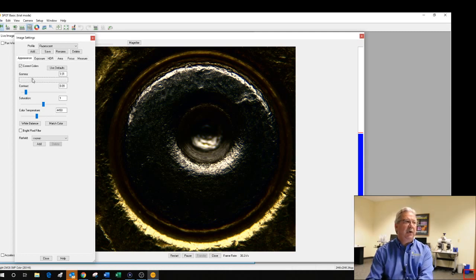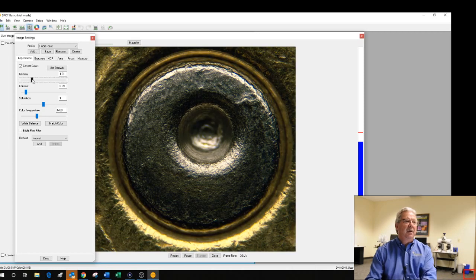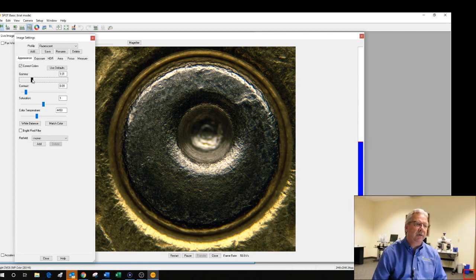Usually you're trying to pick something very specific out of the sample and highlight it. You can see it in the microscope, but the camera and our eyes see things differently, and therefore we might need to use gamma to highlight that.